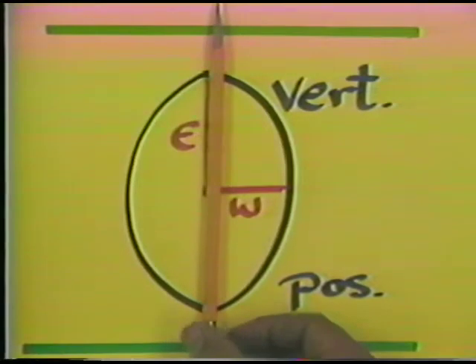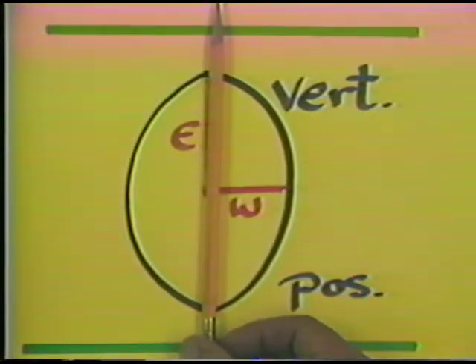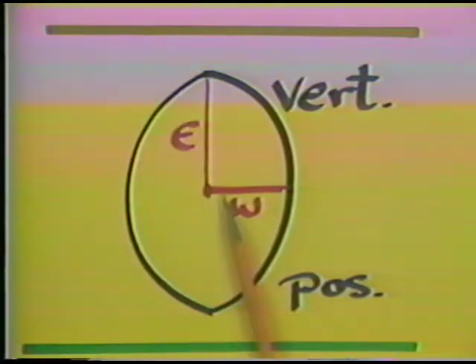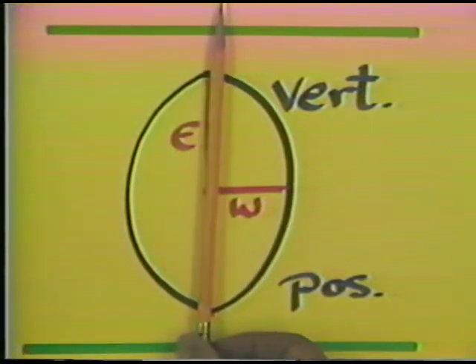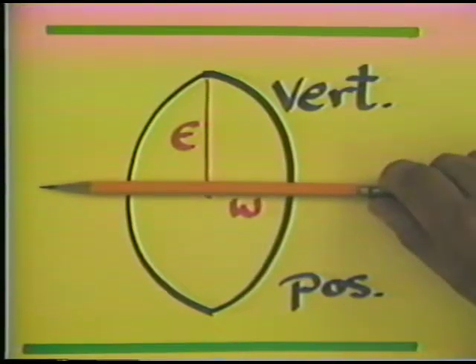Remember that the C-axis is located right here. If you have the mineral in this orientation, then you can say that the C-axis of that mineral is lying effectively on the stage. The epsilon refractive index is measured here, omega measured in this direction. These also represent the position of the E and the O ray respectively.